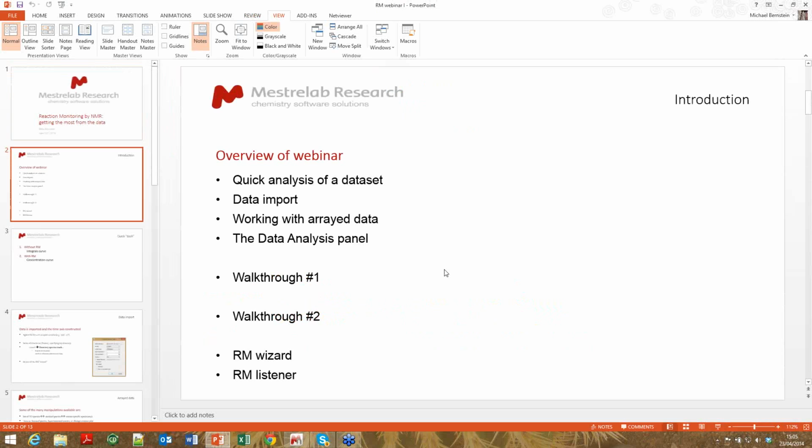Right. So the overview of the webinar today is that I'm going to start with looking at some data sets, and I'm just going to analyze them extremely quickly, and the purpose of this really is to just show you how quickly and easily these things can be done. And then once I've done that, I'm going to settle in and talk in a little bit more detail about data import. The general working with arrayed data is important to understand and have a bit of a feel for, because it's really the underpinning of everything to do with reaction monitoring.